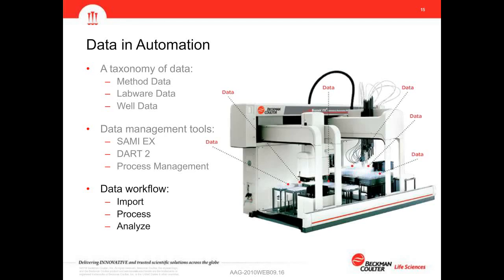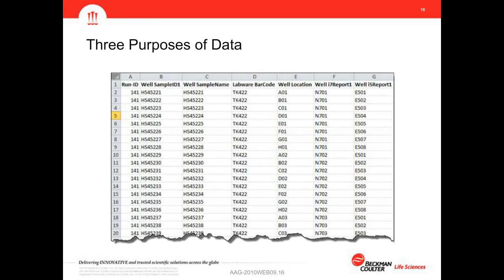So there we moved quickly through 3 data management tools. Once again, these are the tools that Beckman Coulter uses for data management. There are other tools on the market available. What we really want to talk to you about is how to make a data management plan that sets you up for success. So we'll move to the final element of our discussion today, talking about the data workflow.